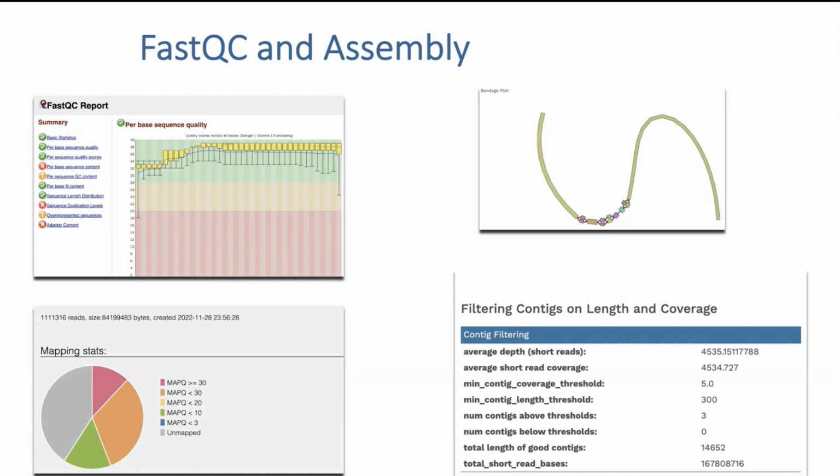And for assembly, right now we only offer de novo assembly, which can be useful especially for amplicon-based sequencing of viruses. But we are also working on reference-based sequence assembly pipelines, and we're hoping to have those available in the near future. But you can use our de novo assembly to assemble your viruses as well.